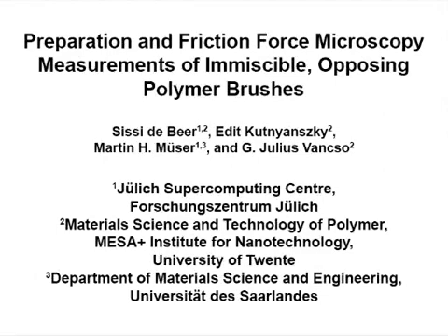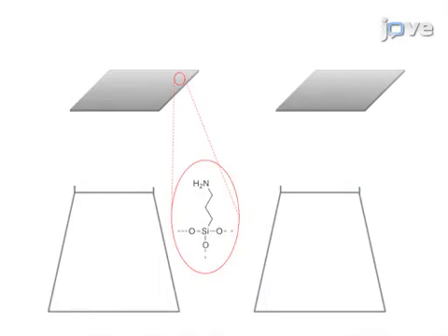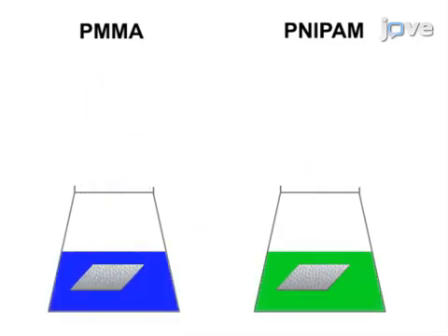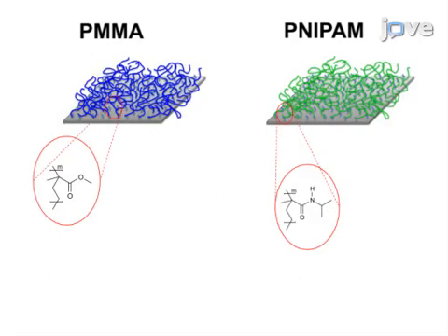The goal of the following experiment is to prepare immiscible polymer brush systems and compare them to traditional miscible polymer brush systems by measuring the frictional response to relative sliding motion for both systems using friction force microscopy. This is achieved by starting with two sets of silicon surfaces and grafting P-NiPAM onto one set and PMMA onto the other. These will be the flat polymer brush surfaces used to form one part of the polymer brush systems.